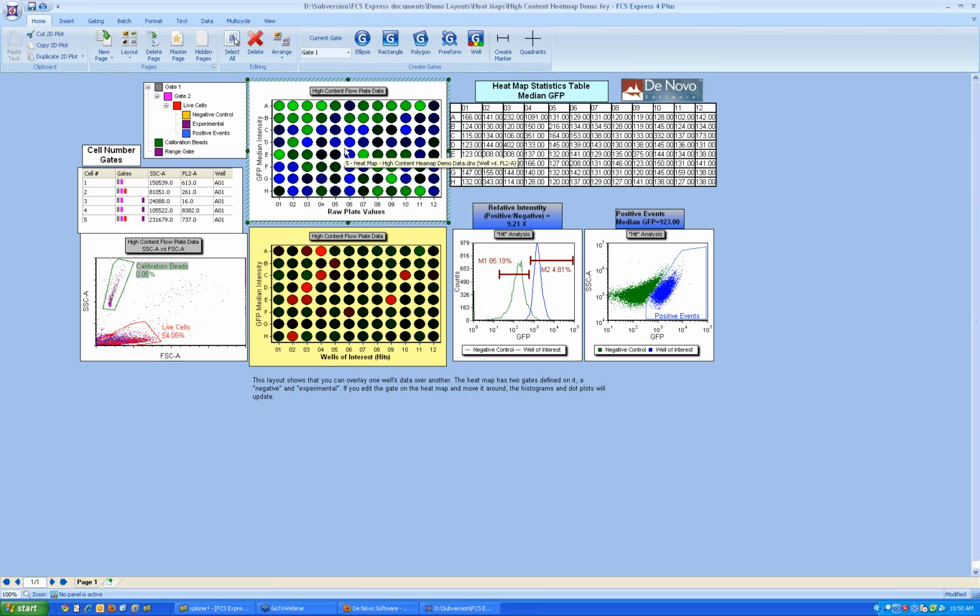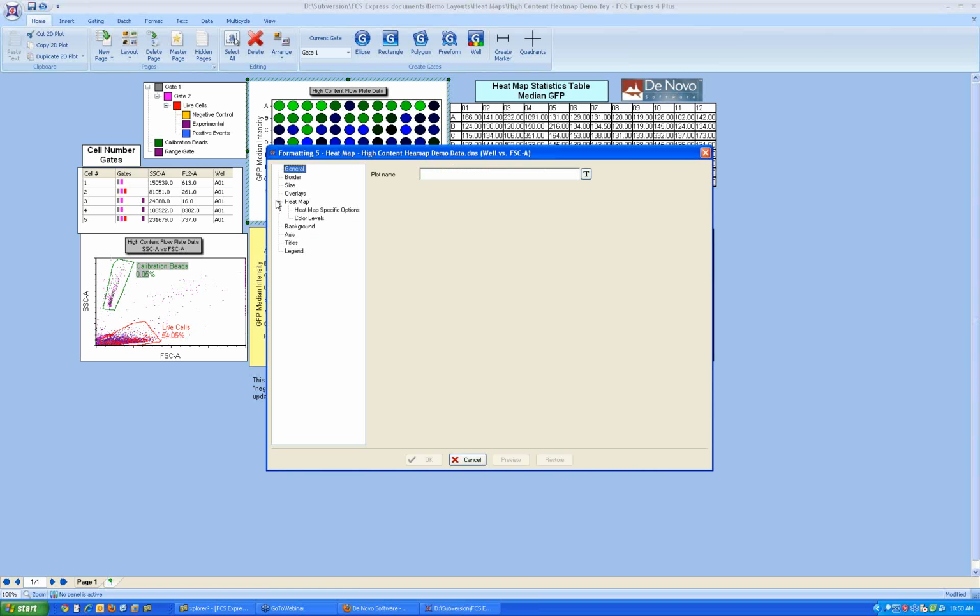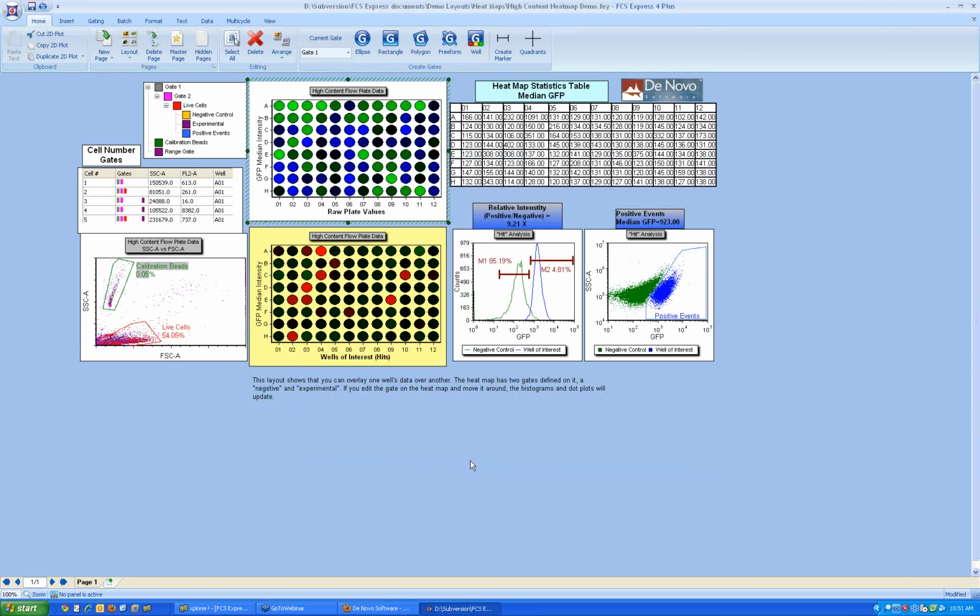Okay, we support many different coloring schemes. This is one of the many coloring schemes. You can change them at our color levels, and you can see that we support several different coloring schemes. The details of them we'll go over in another webinar. The cool thing about the plots is that they can be gated. They work on any size plate from 24 well plates, I think 8 well plates, to 1536 well plates. So they work with any kind of plate.